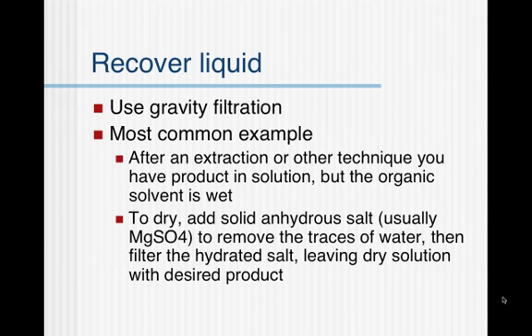If the material you want is the liquid, you're generally going to use what we would call gravity filtration. The most common example of this is that after an extraction or some other technique, you have the product in solution, but the organic solvent is wet. Water is very difficult to get rid of once you've evaporated away the organic solvent, and so you should dry that solvent as best you can before you evaporate the solvent away and actually recover the isolated product.